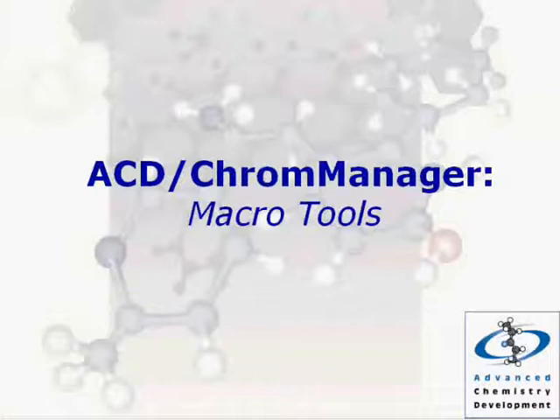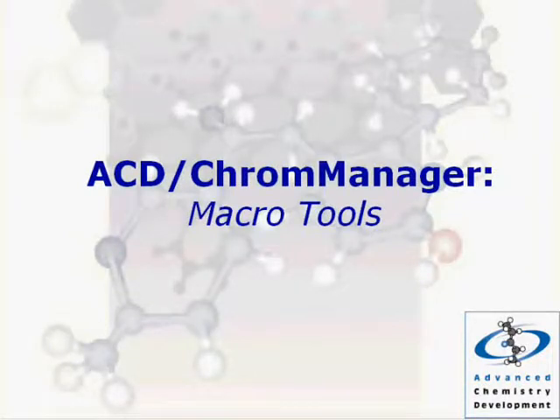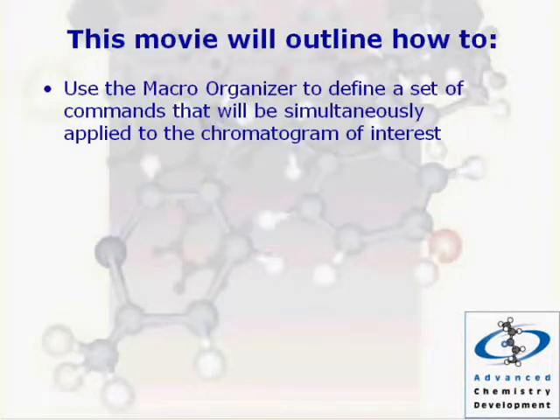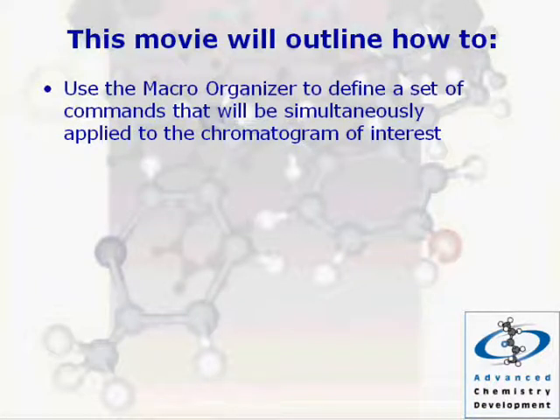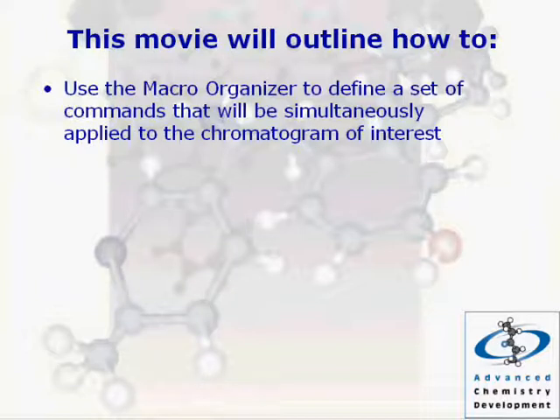Welcome to ACD Chrome Manager, Macro Tools. This movie will outline how to use the Macro Organizer to define a set of commands that will be simultaneously applied to the chromatogram of interest.